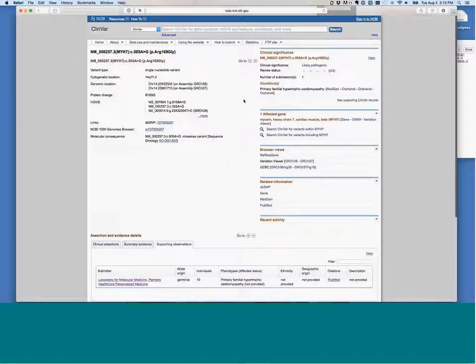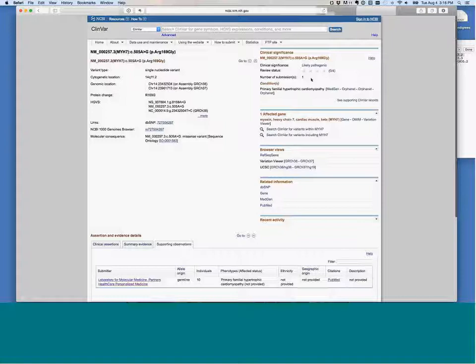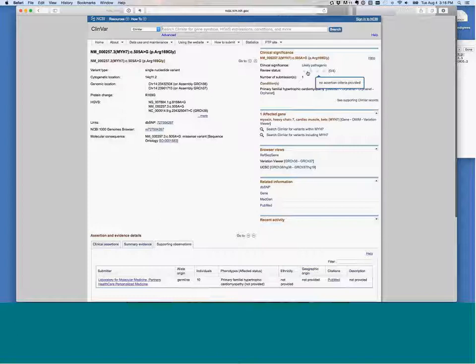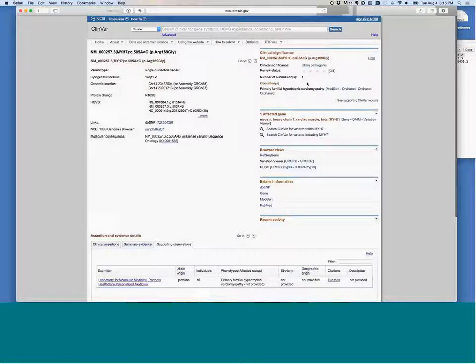You can get a quick overview up top of what the clinical significance is asserted to be by the submitters and how many submitters there are. This star system can also tell you about roughly how confident one can be in the assertion — for a case like this, there is only one submitter and there was no assertion criteria provided, so it would be no stars.